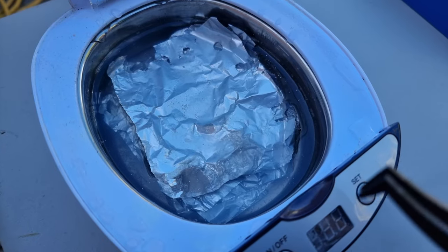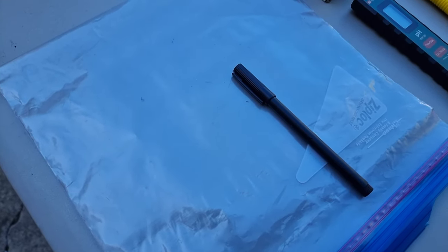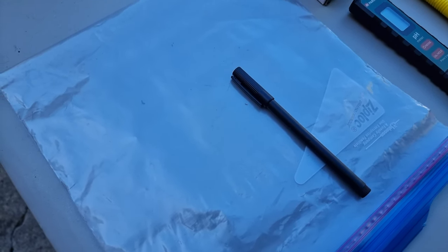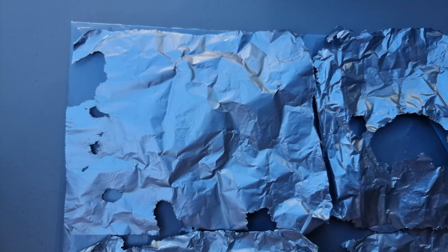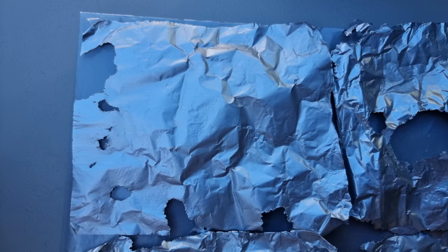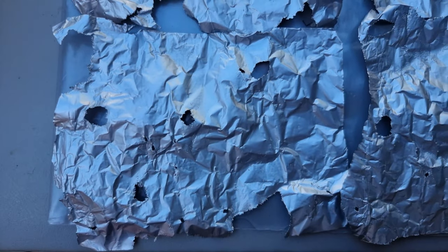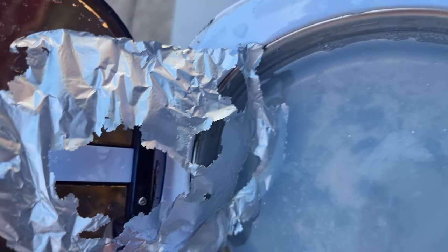We're going to take these sheets out, dry them, and then put them in this bag here for a look on the SEM later. Here are the sheets. This is the topmost sheet underside, this is the second sheet underside, this is the third sheet underside, this is the fourth sheet underside, this is the fifth sheet underside, and this is the sixth sheet underside.